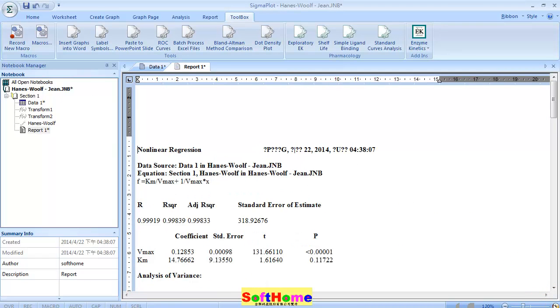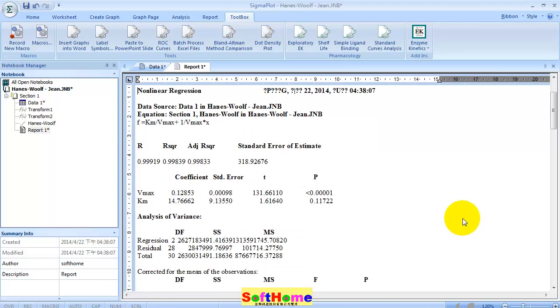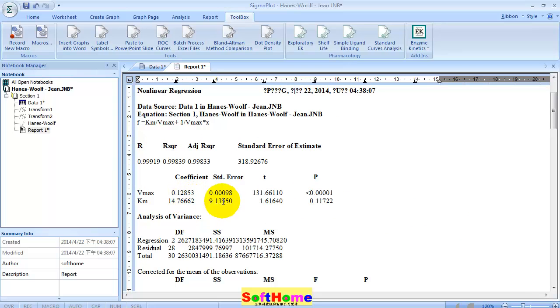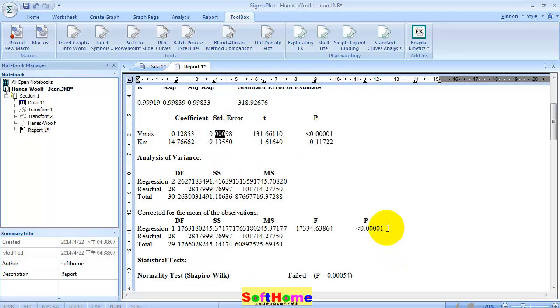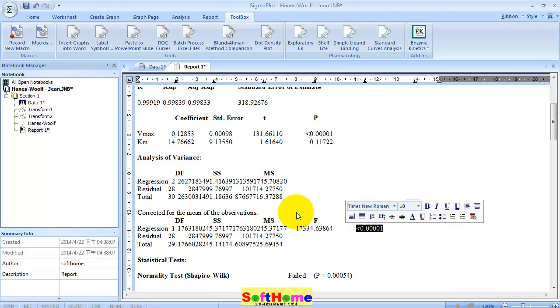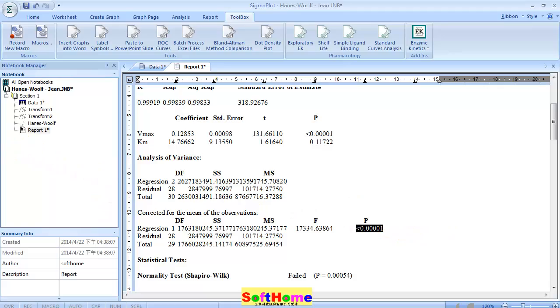You can see the R square here, and Vmax and Km here with their standard errors. Also the p-value here. Thanks for your watching. Goodbye.